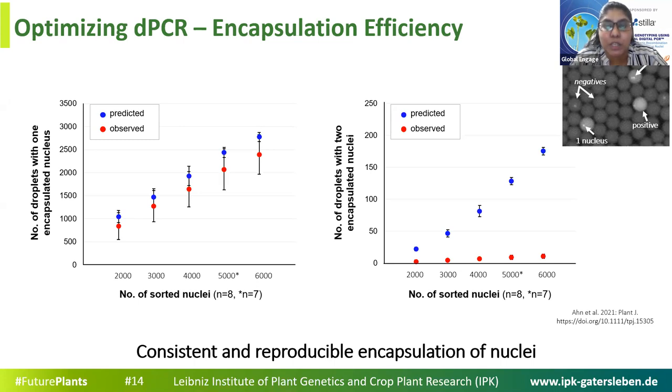Okay, the next question. Were you using commercial PBS sheath fluid? If so, which one? Or did you prepare your own in the lab? I think it was homemade. It was homemade. It was 1x PBS. Concentration was 1x.